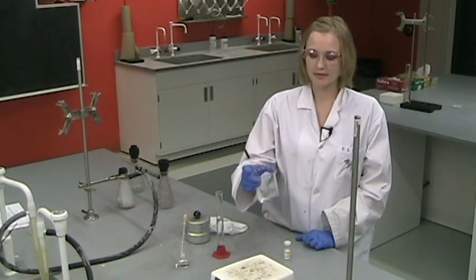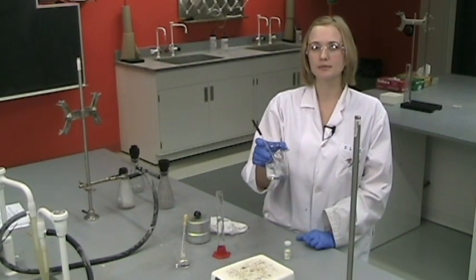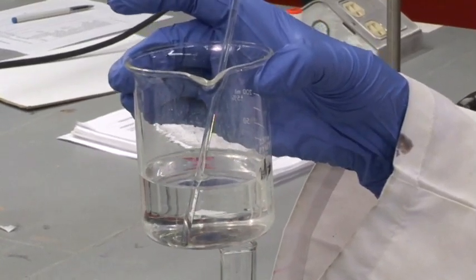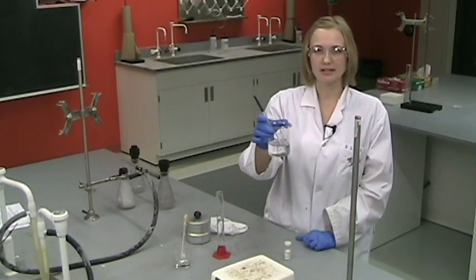You will then dissolve the sample in about 100 ml of water and have your TA add 1 ml of 6 molar nitric acid so that you will completely dissolve your sample.